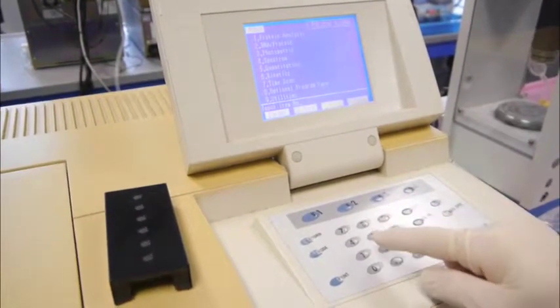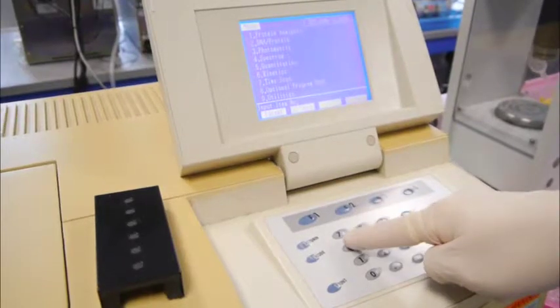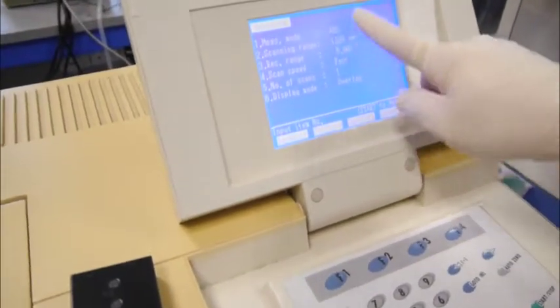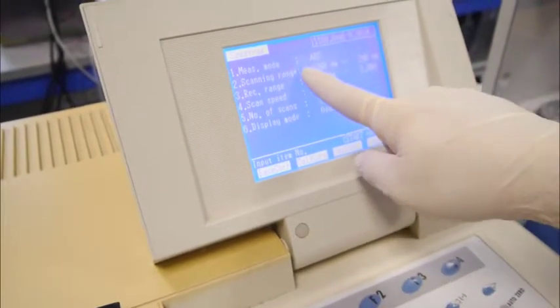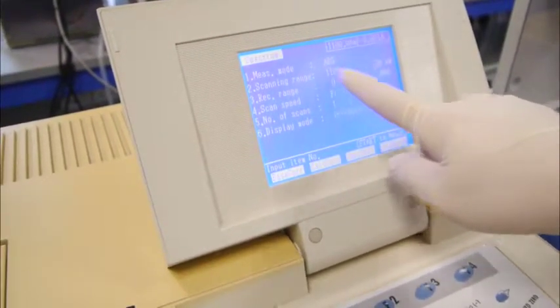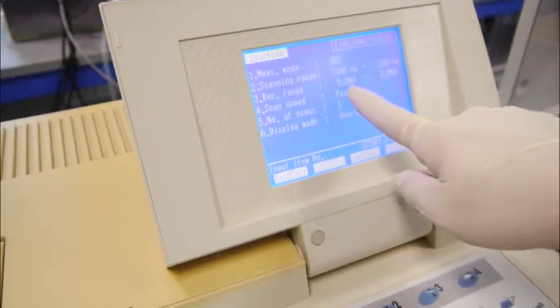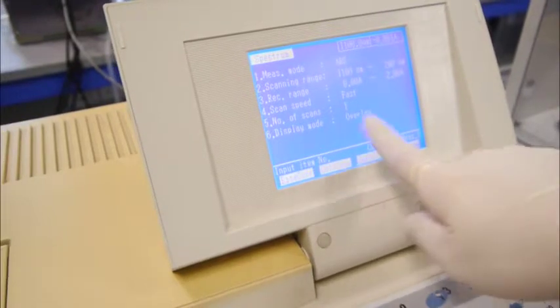For today, at the beginning of this analysis, we will have to determine the lambda max value. So we need to go to mode 4 under spectrum and select 4. Before we do the lambda max value, we have to set the parameters according to your SOP. In this case, our measurement mode will be absorbance, scanning range will be 1100nm to 200nm, recording range will be 0 absorbance to 2 absorbance, scanning speed fast, number of scans will be 1, and display mode will be overlay.